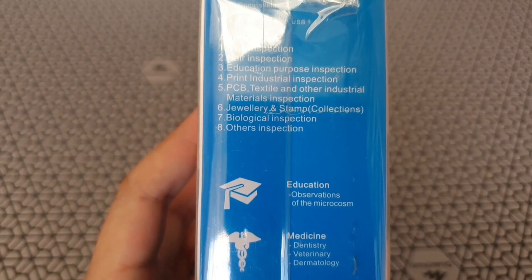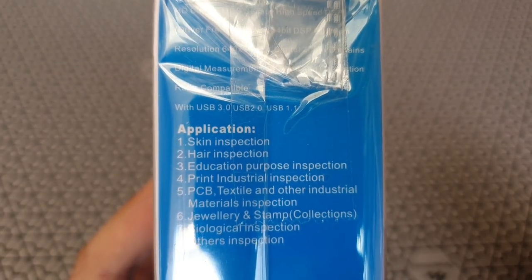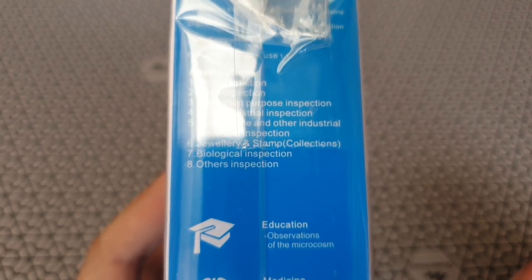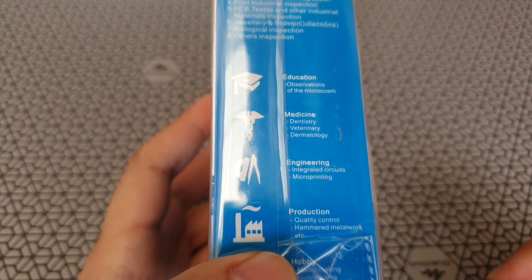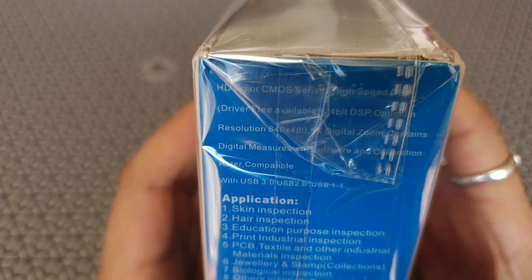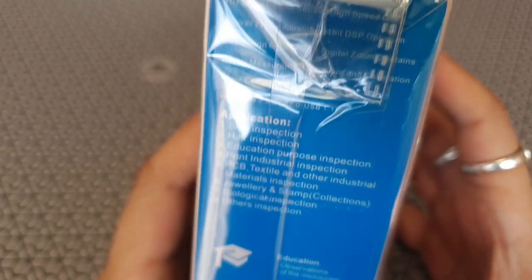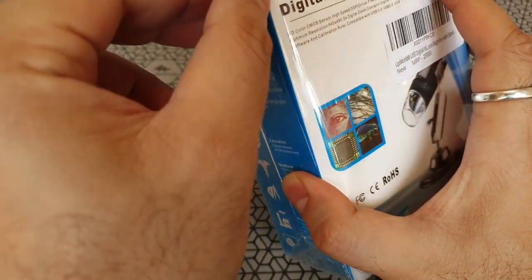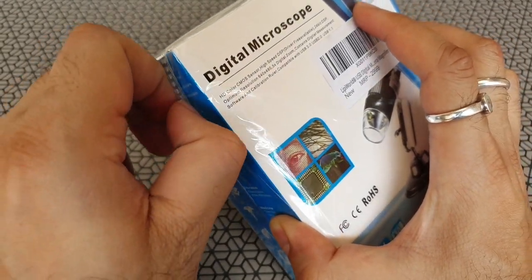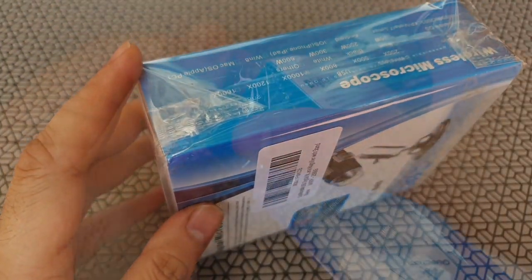Some of the common uses of this microscope are to look at skin closely, look at hair, insects, possibly PCBs — if you have small circuits you want to zoom up and inspect. You can look at jewelry, stamps, currency, and anything else that is very small and needs a little bit of magnification.